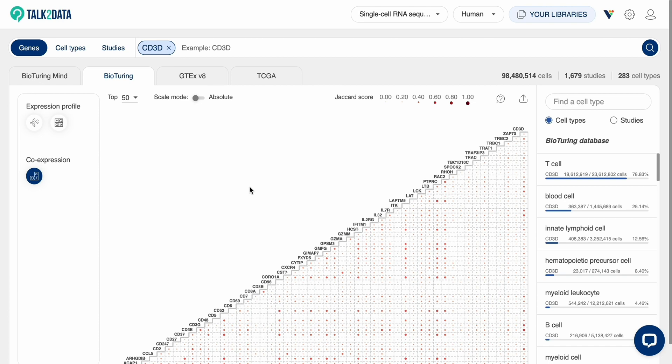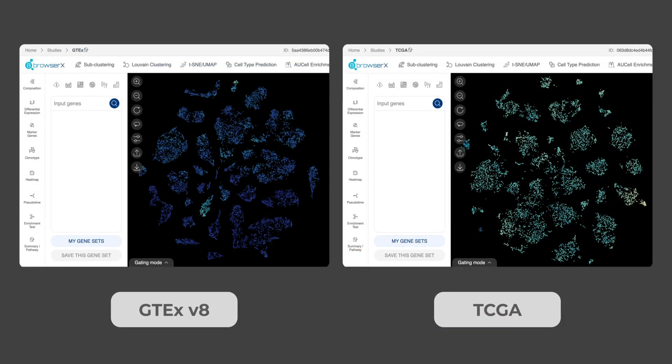In addition to the BioTuring database, we also support analysis with GTEx and TCGA datasets. They are presented as a dataset, and you can perform the analysis using the BBrowserX interface.